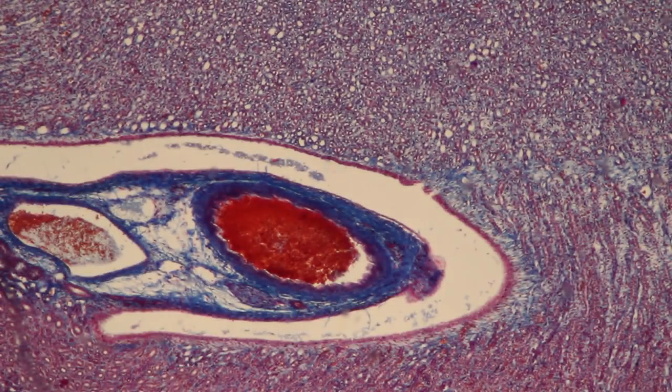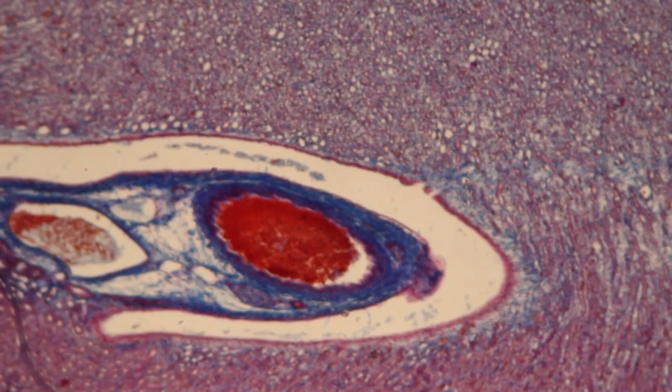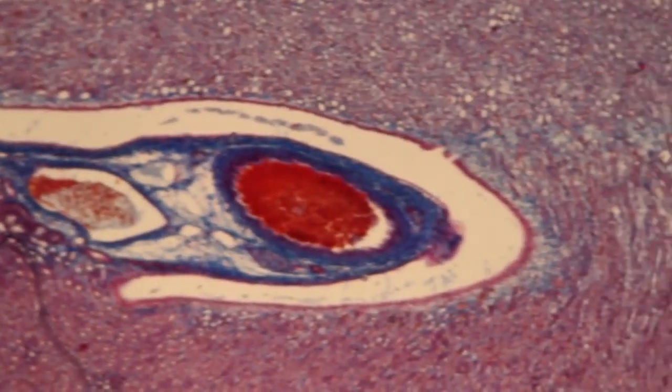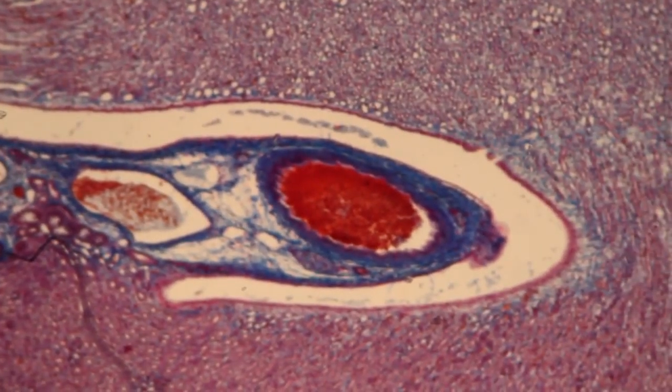We are now looking at the image seen through the 4x objective — it's very much out of focus. Now I'm lowering the stage by turning the coarse focus adjustment knob. The image is now very nicely in focus. I use the two knobs to move the mechanical stage and center the image. Now I can rotate the 10x objective into position.